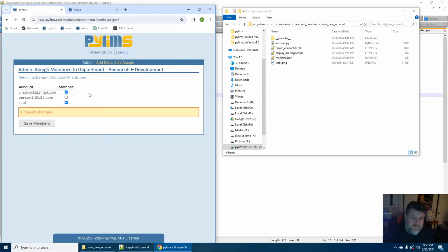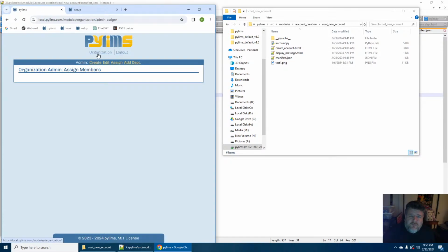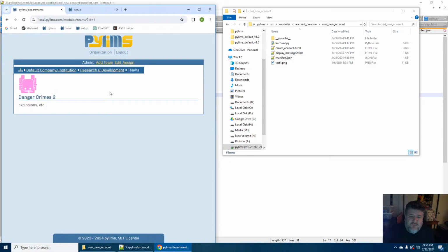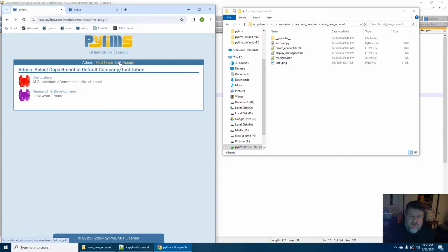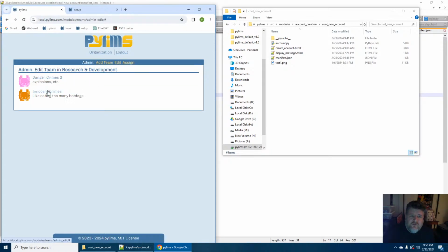Yeah. Anyways, organization. Oh, that's right. That's broken. I gotta fix that. Change something. But same thing. Teams you can edit or you can assign people. Oh, that's fun. Oh, there's no teams in there. That's right.